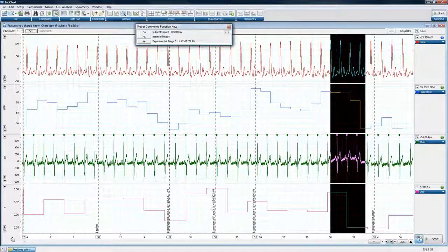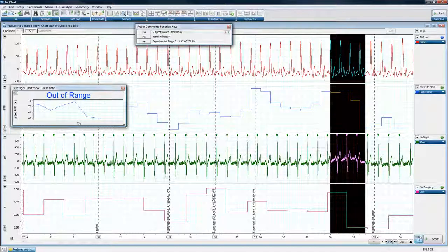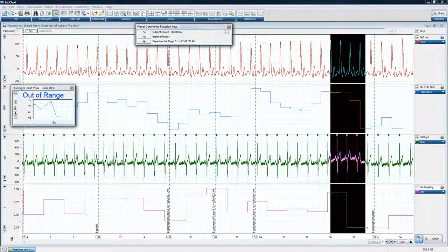Many of you may know how to use the marker. The marker is a little tool down here in the bottom left. If you see my cursor hopefully circling around it down here, this is the marker. If you click and drag the marker and place it in a piece of data, as say right here, what happens is, I'm going to put it back, and we're going to look at it this way.